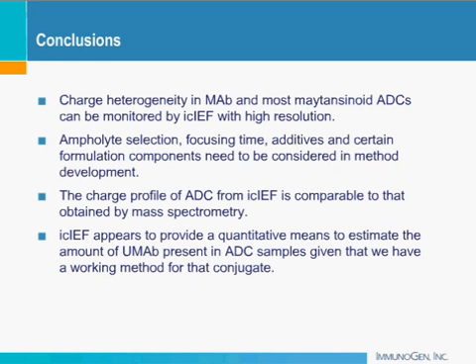And the data shown here was all for the methods that have been working, but we do have antibody-drug conjugates wherein we cannot develop, for unknown reasons, a proper working method by ICIEF, and then we have to look at other methods. But for conjugates which have a working method, all these things are very useful, and ICIEF provides a very useful tool in looking at charge heterogeneity and other parts of the conjugate.